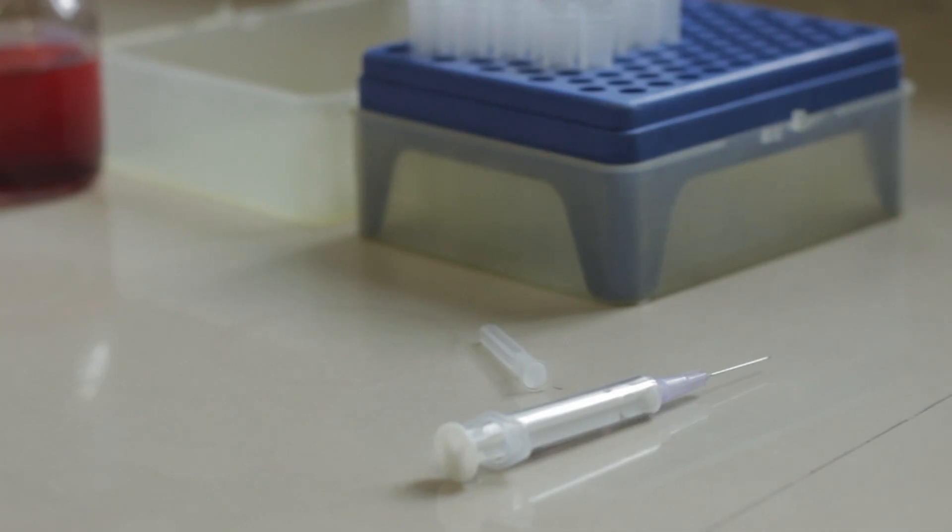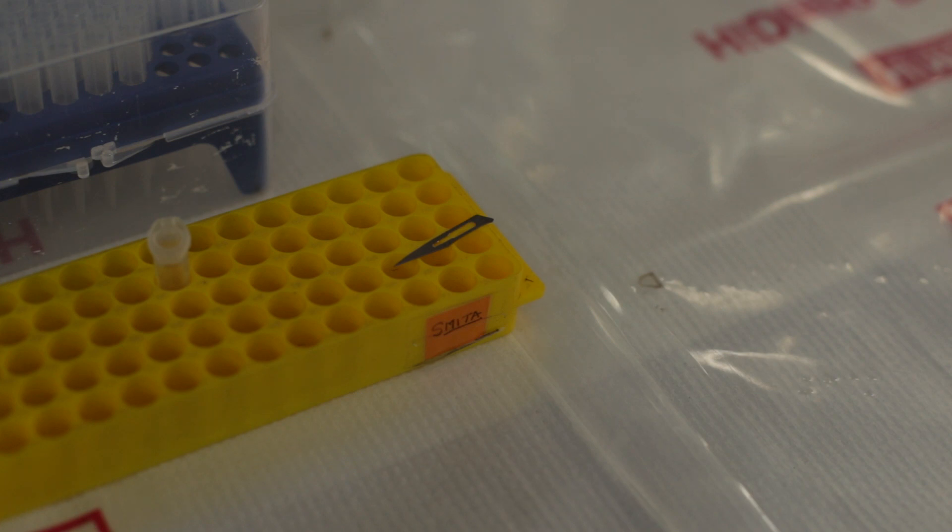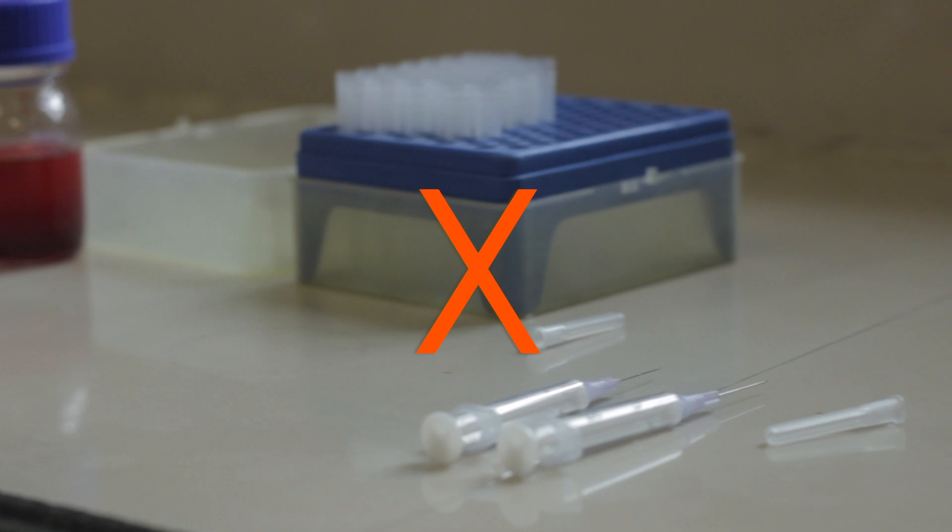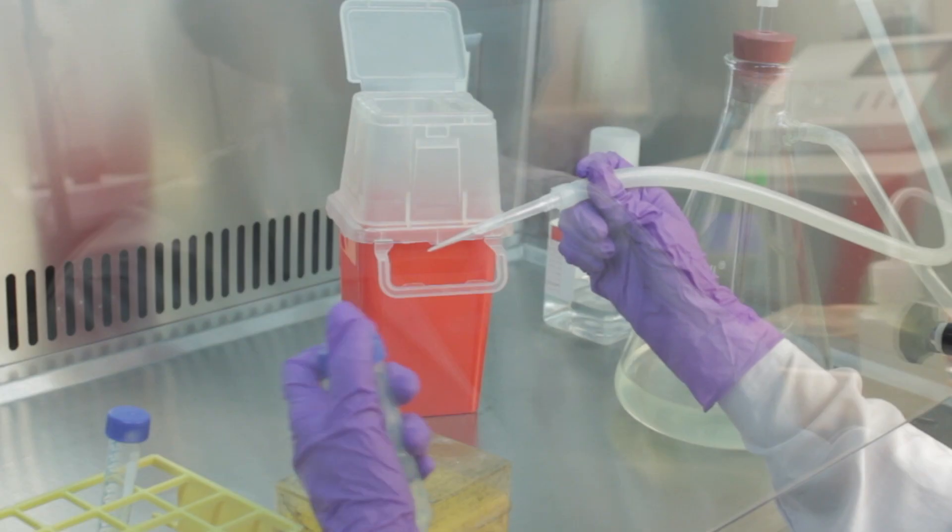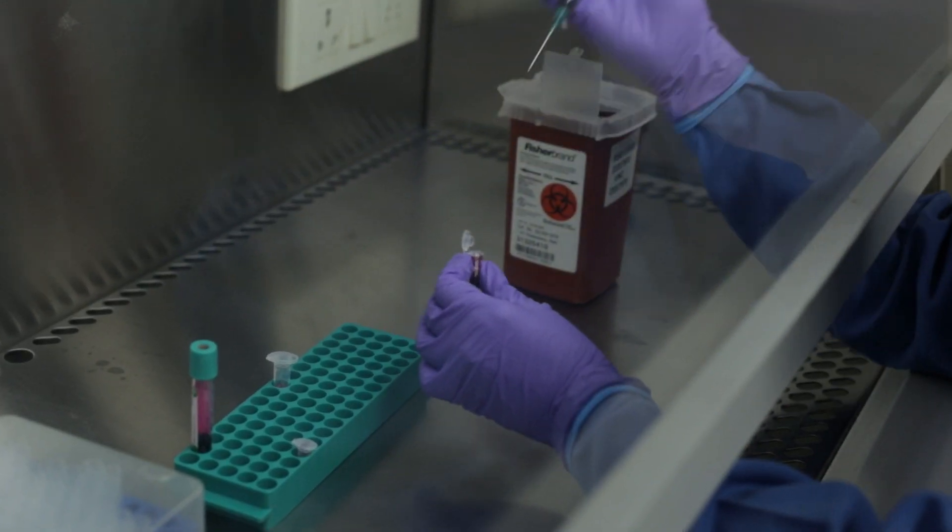Some of the sharps commonly used in laboratories are needles, glass slides, scalpels, and blades. Use of sharps must be avoided wherever possible. If it is necessary to use a needle, needles with blunt edges must be used wherever possible. Never leave needles unattended on the work bench.